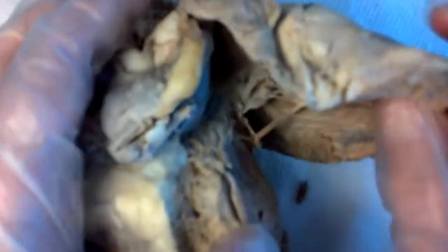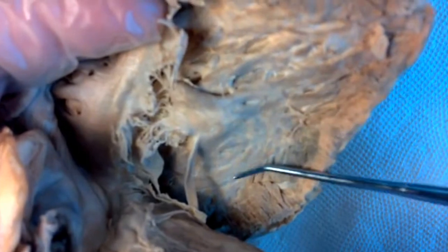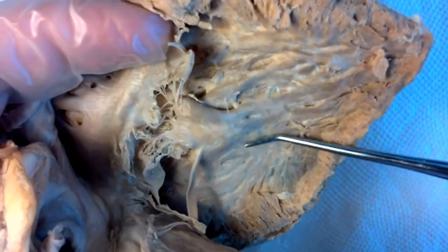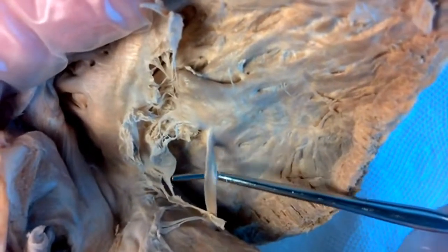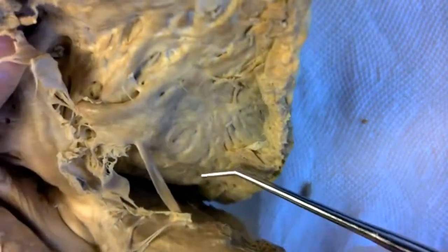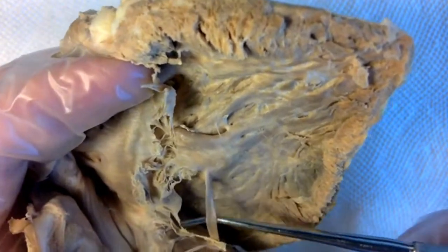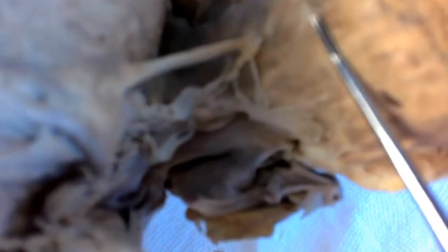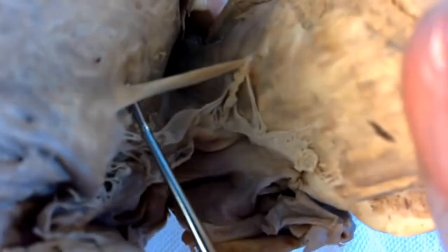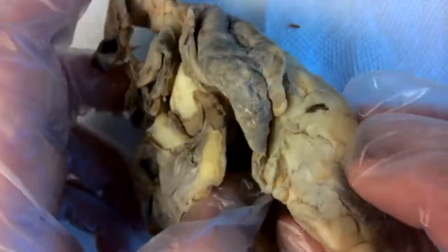Come back to the posterior side here. The ridges of muscle that you see inside the walls of the ventricle here is called trabeculae carneae. And then in the sheep heart is this structure that spans from the papillary muscles here over to the interventricular septum, the wall between the ventricles. So it goes across that ventricle there to the papillary muscles to help coordinate the beating or the contraction of the muscle. Okay, so it extends from the interventricular septum over to the papillary muscle. Humans don't have that in their hearts.